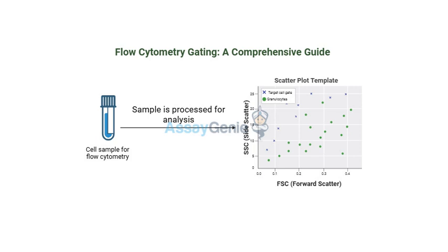Sure. Let's say we're interested in regulatory T cells. Those are called TREGs. They're super important for keeping the immune system in check. Right. They make sure things don't get out of control. Exactly. And TREGs have a specific combination of markers, including CD4 and CD25. With Boolean gating, we can make a gate that only includes cells that are positive for both of those markers at the same time. So our condition would be CD4 AND CD25. Oh, so only cells that have both get in.